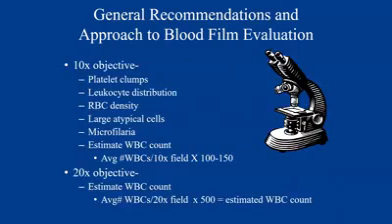We have different objectives. Most scopes come with a 10, maybe a 40, and maybe 100 oil. If you are super interested in pathology, it may be to your benefit to get a 20x objective and a 50x oil, but again, they're not a must. They are expensive. They're also really good for cytology as well. But just be aware that they cost a little bit more money and are not standard.